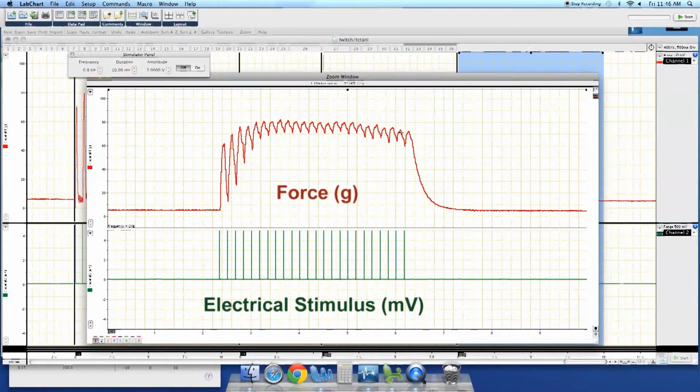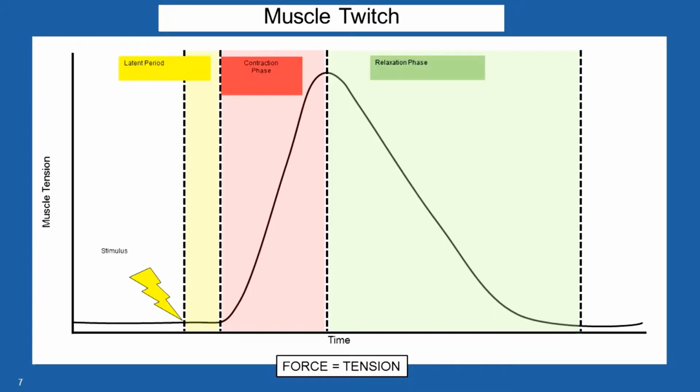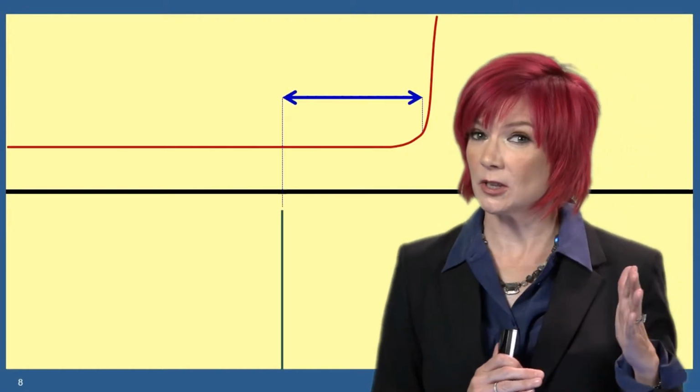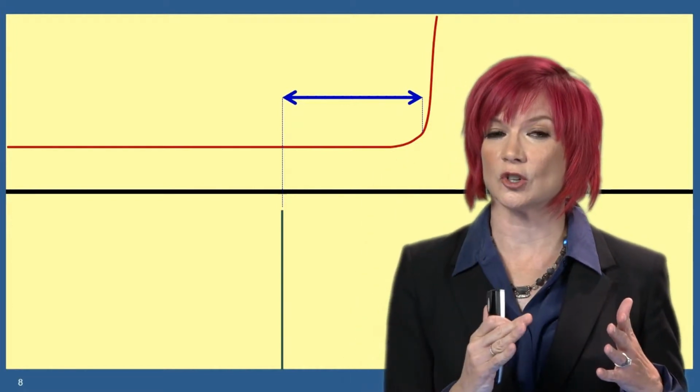The green line at the bottom is a readout of the electrical current being applied to the isolated muscle. Each spike indicates a single pulse. The red line on the top measures muscle tension as detected by the force transducer. These readings are both made in real time to produce the electromyograph. The force is plotted as a function of time for a single twitch, as shown here. We can also measure the latency, which is the time delay between stimulus and the initiation of muscle contraction.